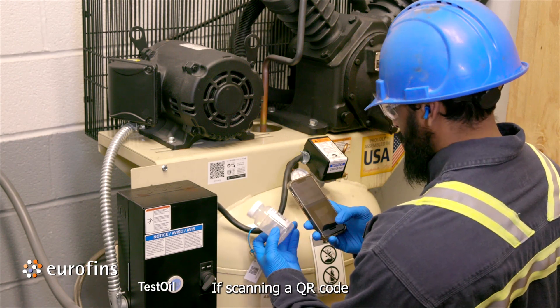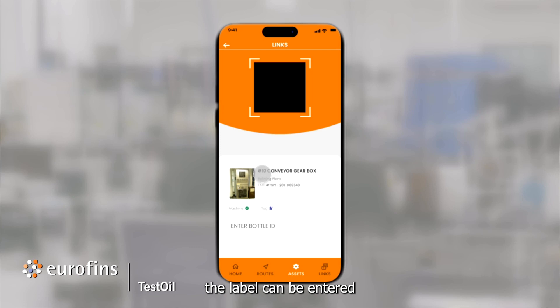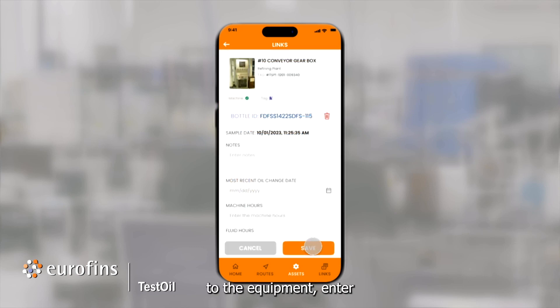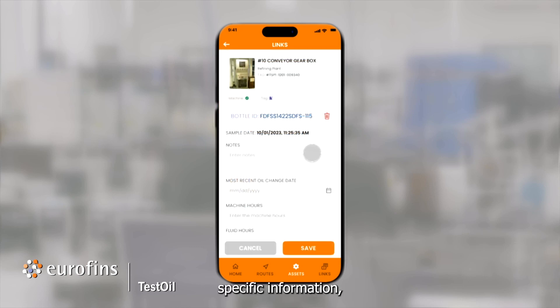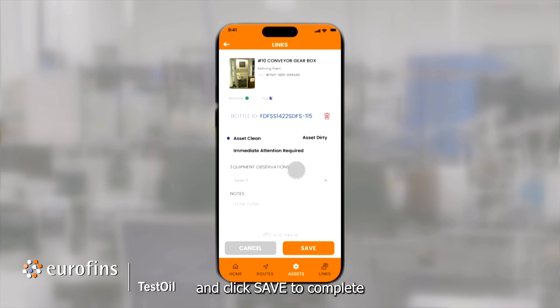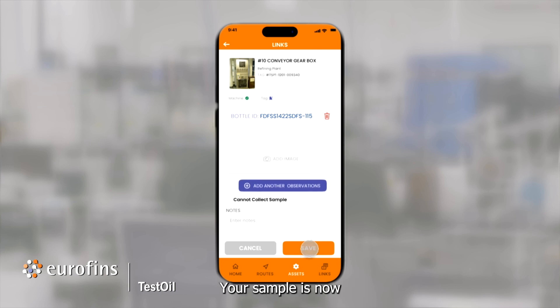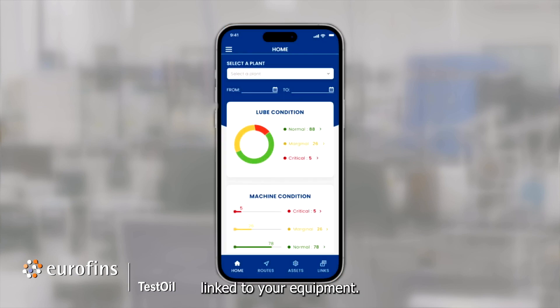If scanning a QR code is not an option, the bottle ID on the label can be entered in this field here. Once a bottle ID is linked to the equipment, enter any sample-specific information, freehand notes, images, or any other observations and click Save to complete your linking. Your sample is now linked to your equipment.